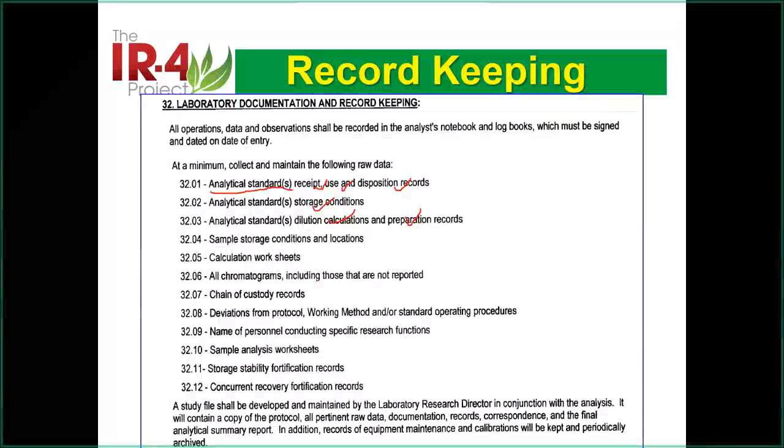What's the storage condition? So it's in the freezer, refrigerator. What is the company requirement for you to do that? And all the preparation, so how you prepare the stock solution, the intermediate solutions, and your working solutions, how you prepare. Do you prepare them daily, or do you prepare them just one time?